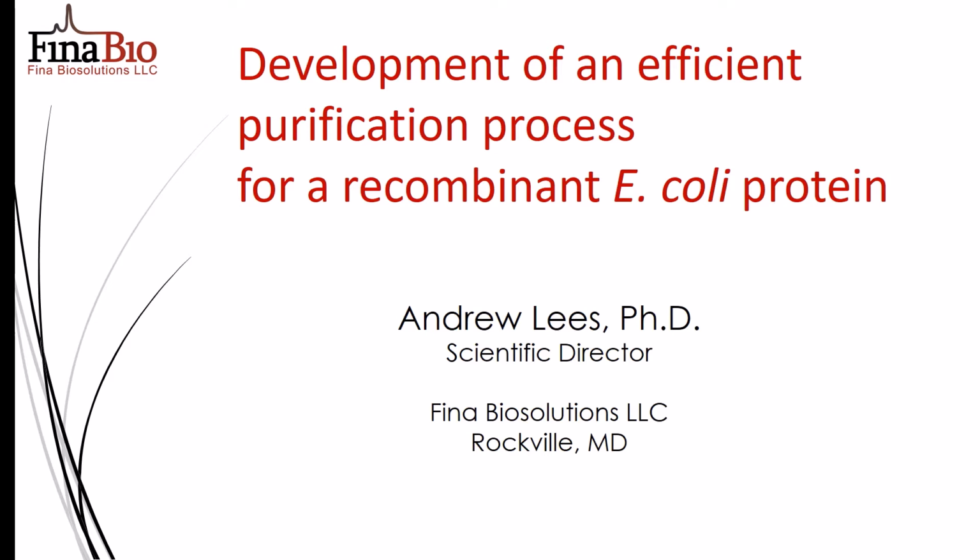In my talk, I will be discussing the development of a purification process of a recombinant protein, which is used in so-called conjugate vaccines. The protein has applications in both clinical and veterinary fields. I'll first tell you a bit about Fina Bio and also about conjugate vaccines, so you have that background.